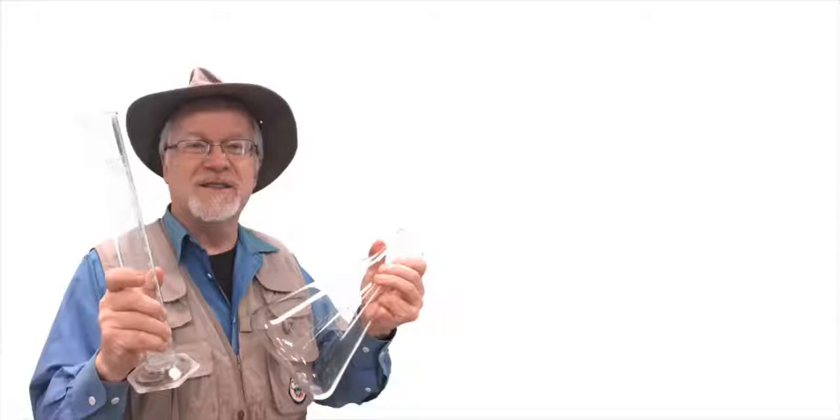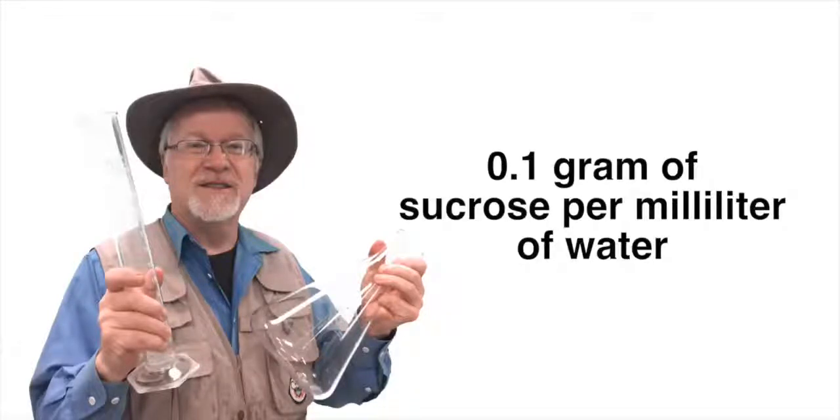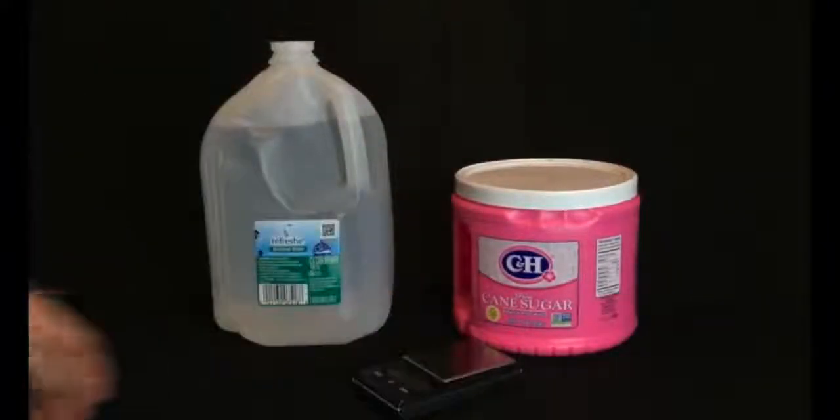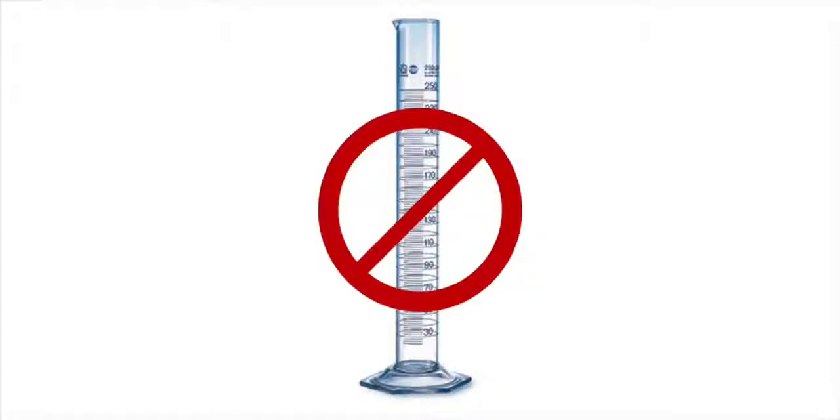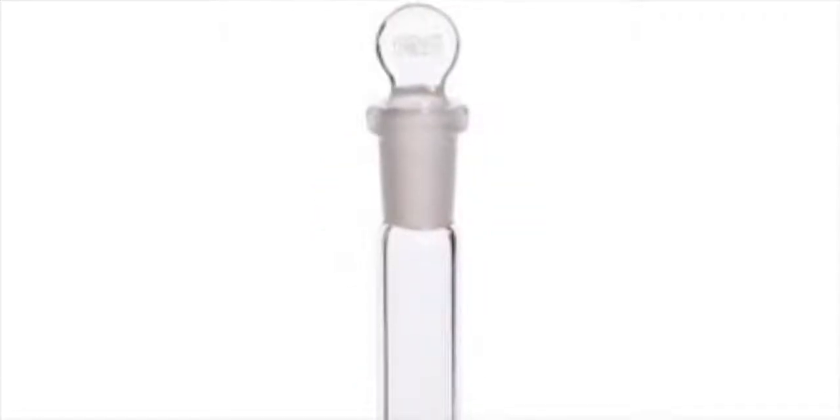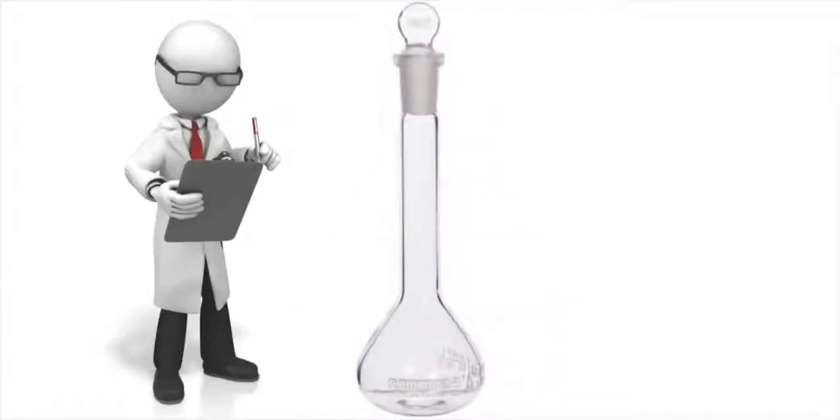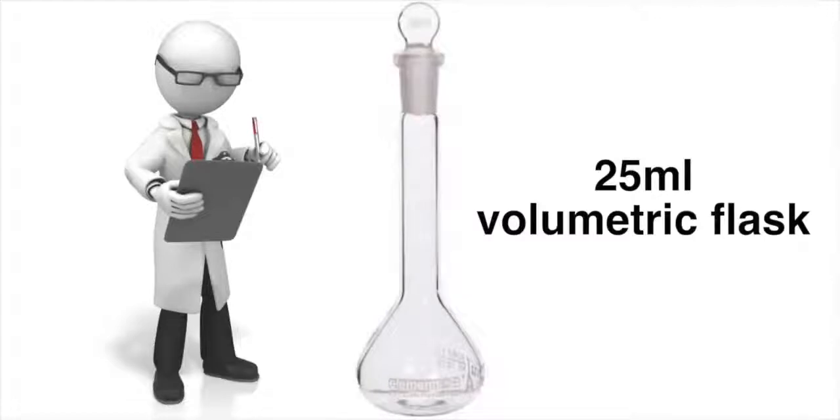Suppose I need to create a solution that is one-tenth of a gram of sucrose per milliliter of water. To create that, I'm going to need four things. First, the chemical itself, the solvent, a digital scale, and one of these wonderful pieces of glassware, a volumetric flask. We're not going to use a graduated cylinder today because the narrow neck on the volumetric flask allows you to isolate a particular volume of liquid much more precisely. In fact, you should always use a volumetric flask whenever you're making up solutions. If you don't have one, check out the links below for sources. My projects usually require only small batches of stuff, so in this video, I'll be working my magic with my relatively small 25 milliliter volumetric flask.